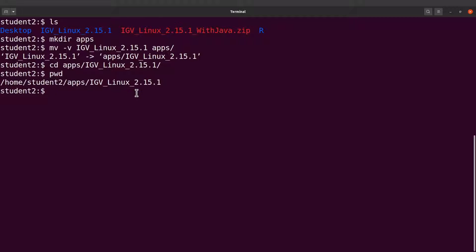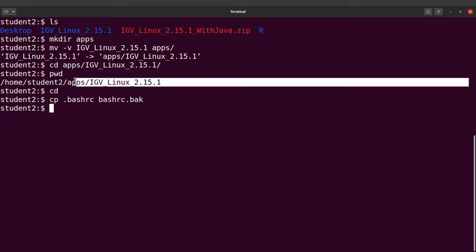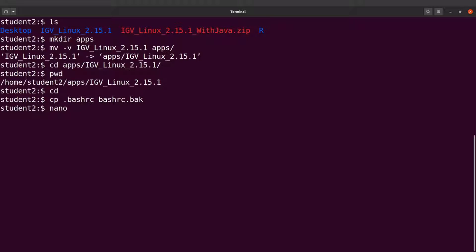I'll cd back to the home directory and edit the .bashrc file to add the IGV directory to the PATH. Before editing, I'll make a backup: cp .bashrc .bashrc.back. This backup means that if anything goes wrong, we can revert. Make sure you are in your home directory before doing this.